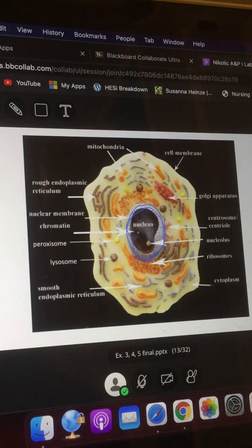So nuclear membrane with pores, that's the blue part here, or gray, and it has little holes in there. Now, my other students couldn't see it when I enlarged it. Apparently from your end it looks wonky, so I have to keep it this size. All right, so that's the nuclear membrane with pores. Awesome. The chromatin is this kind of brown stuff inside. In the lab, it looks like that stuff you use to clean super rough pots. And so this is what's called chromatin. And we'll talk about that when we talk about mitosis. So that's what you want to be able to label.